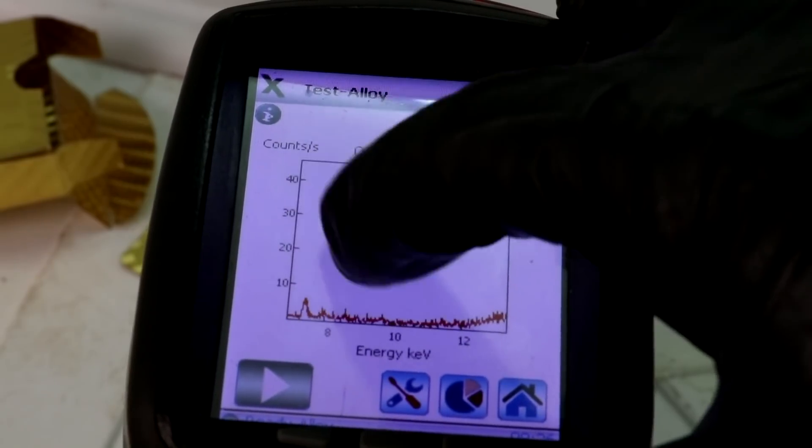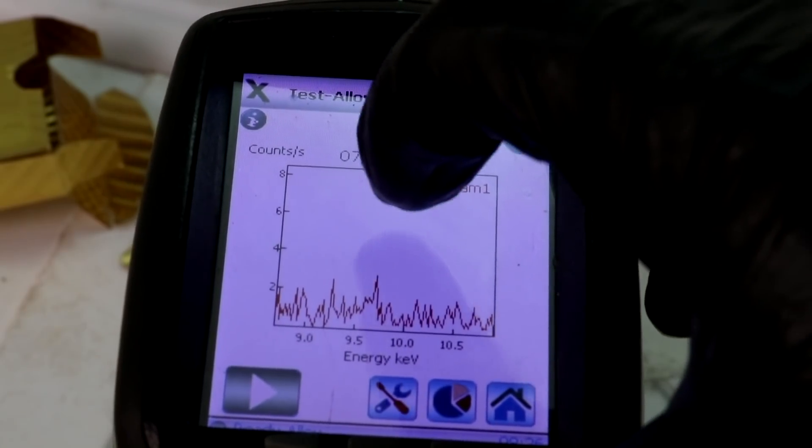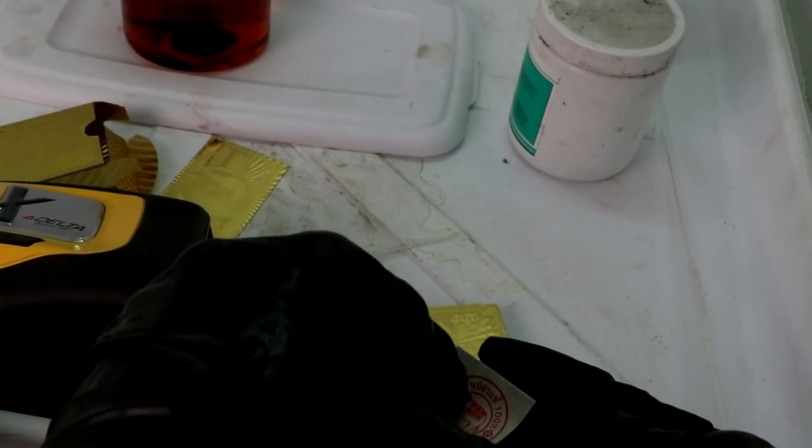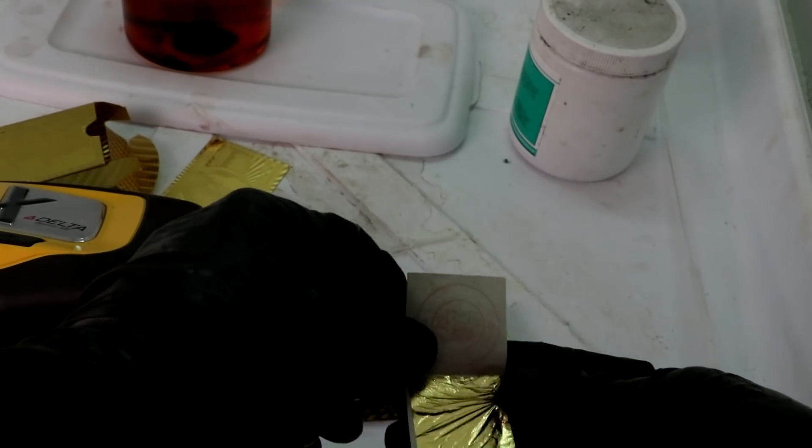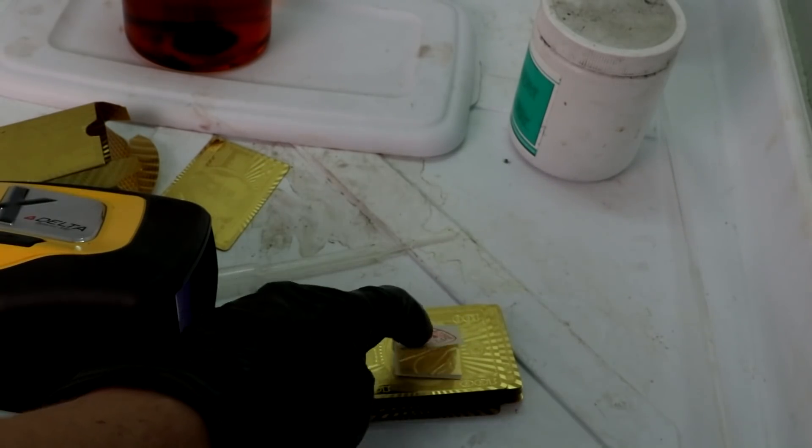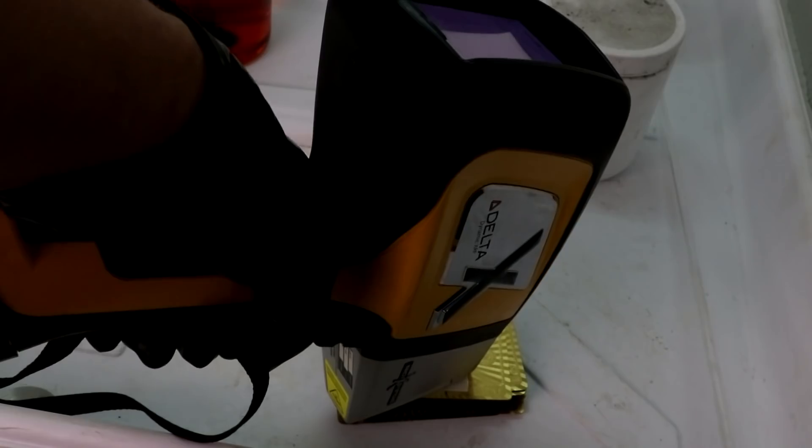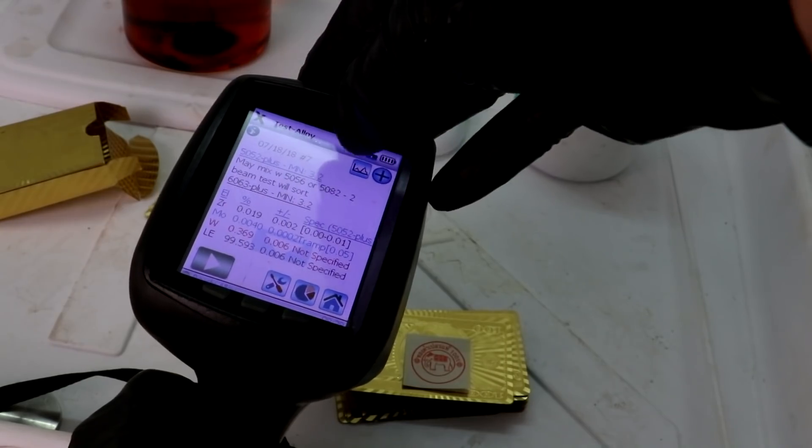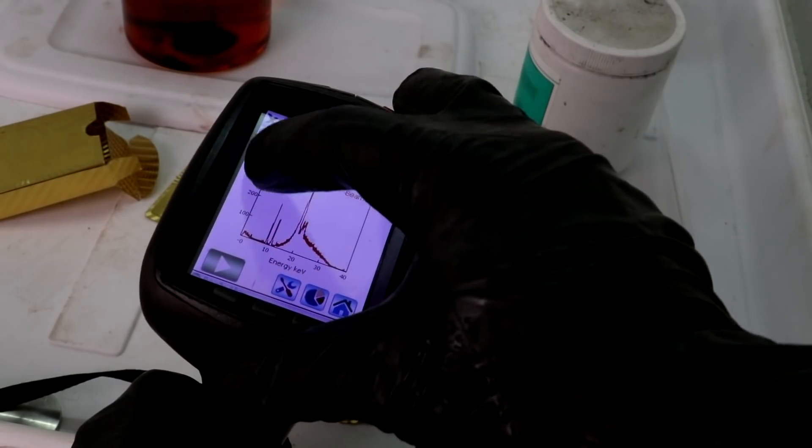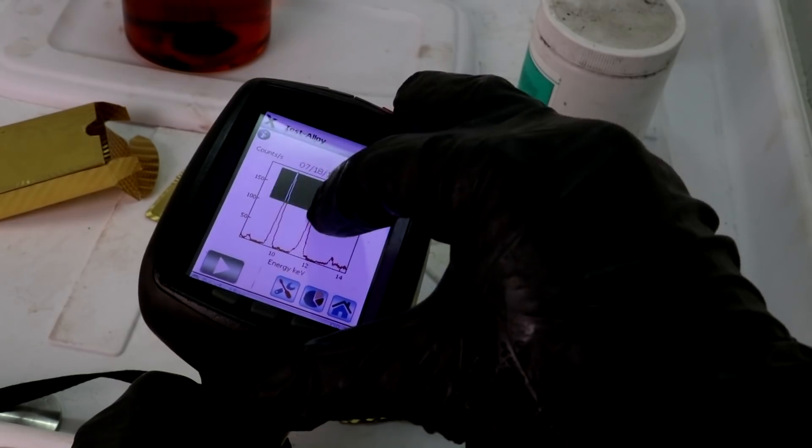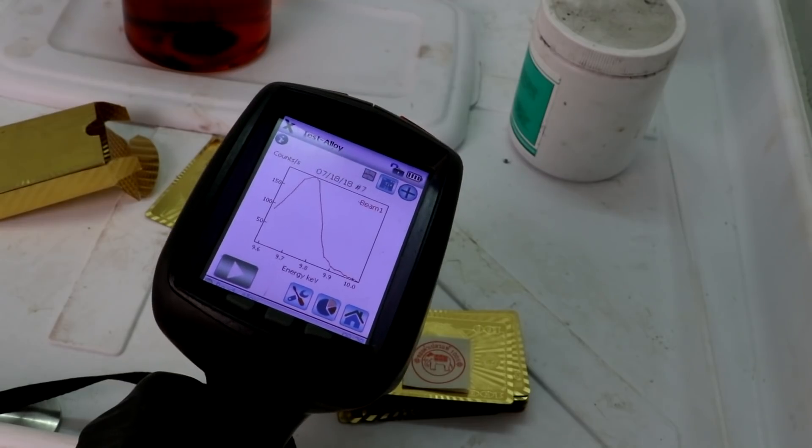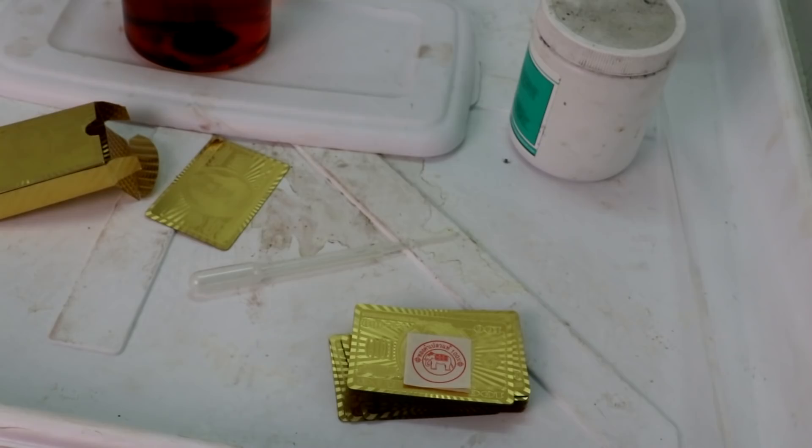So I went and got a piece of gold leaf that I know to be genuine. Let's set this right there. I'll probably just leave it in the paper. That's fine. Let's try this again. Okay. Yeah, I see. Now it's showing the heavy element there. Let's go into the, yep. See those two spikes? Those are our gold. So, the x-ray doesn't lie. These cards are not genuine. That is interesting.